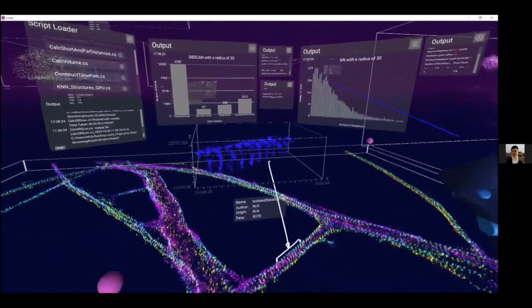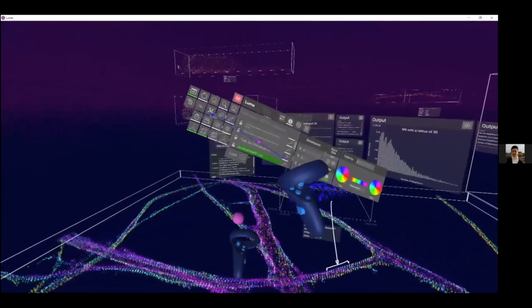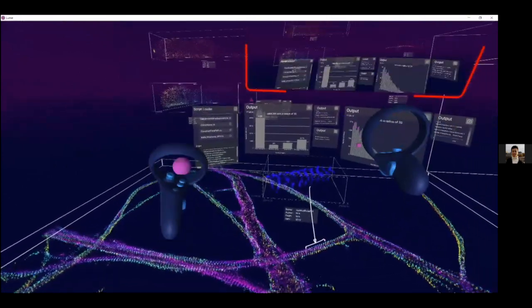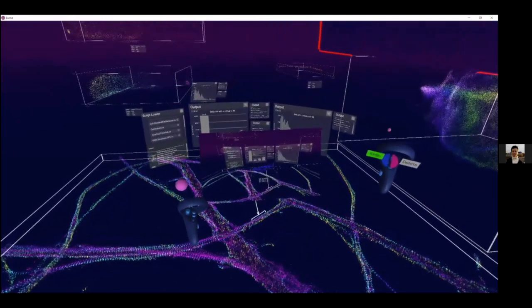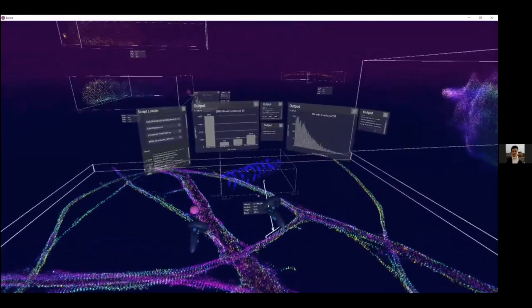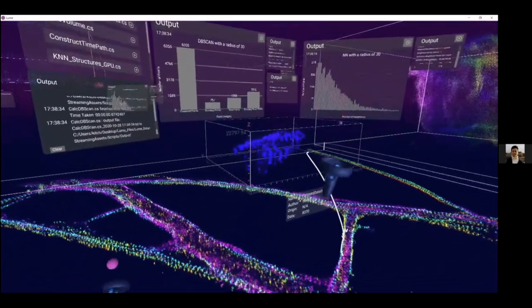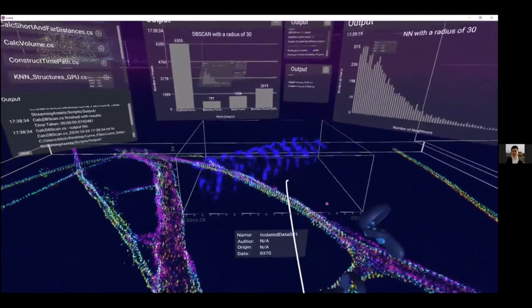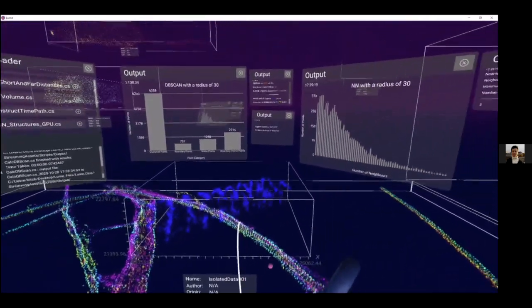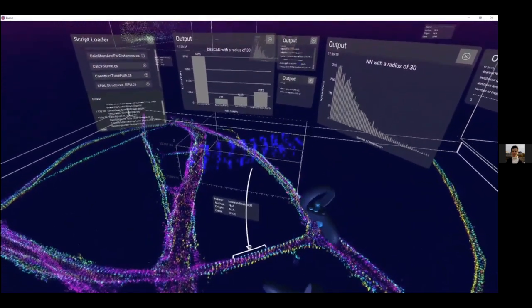functionality is really interesting. And the fact that even right now during this pandemic, people are very digitally connected. This offers another tool where you could, really in real time, share something of interest and possibly one scientist, or two different scientists from different disciplines looking at one sample, might glean different information from it.